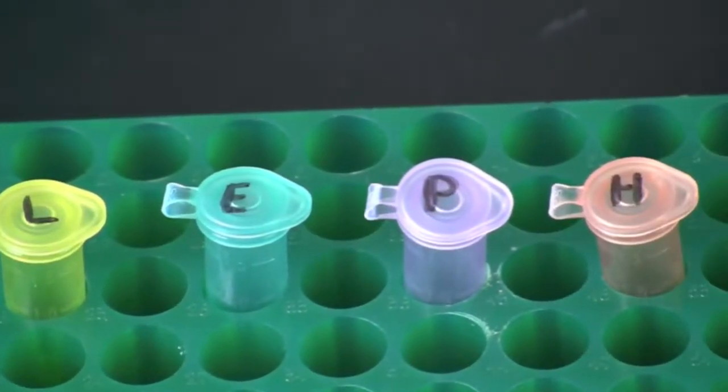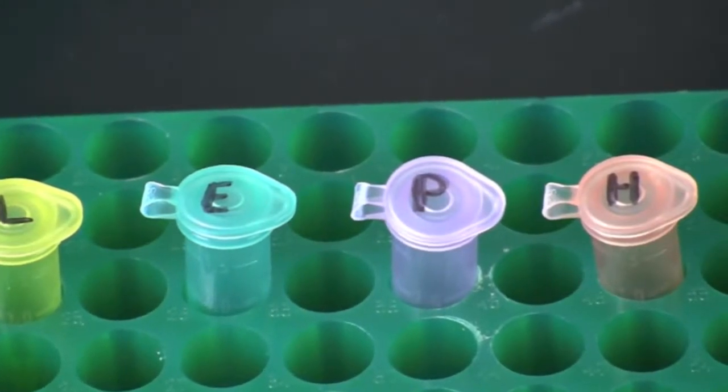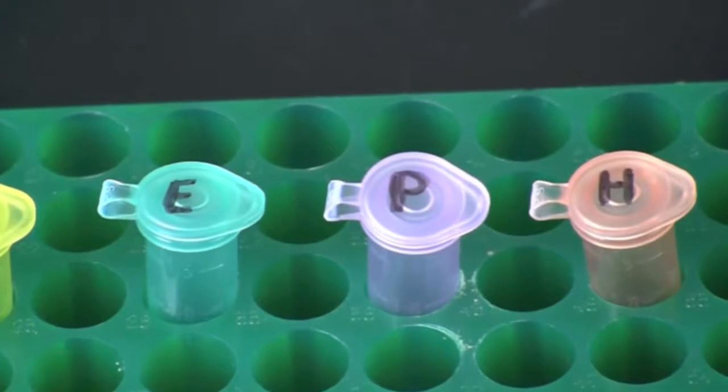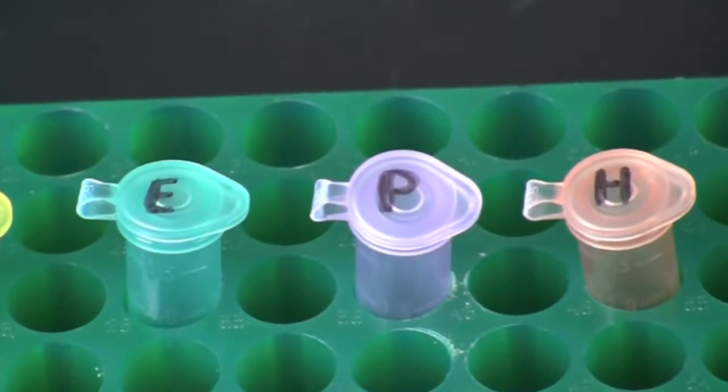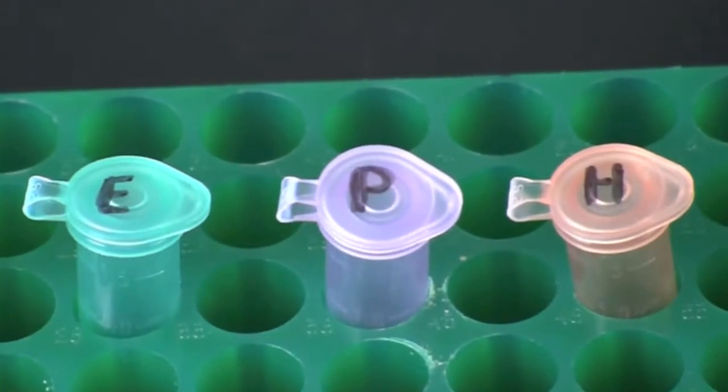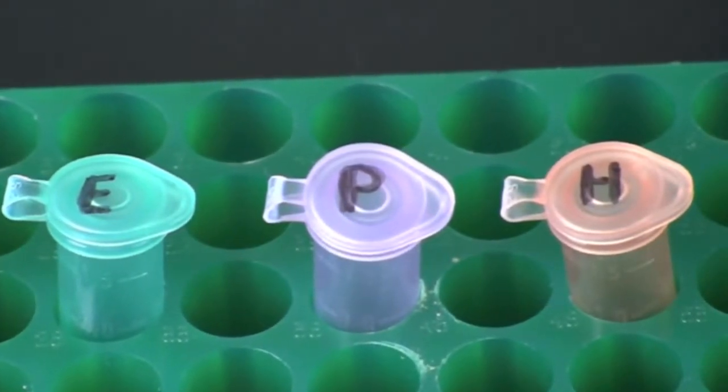Label four color-coded microcentrifuge tubes with L for lambda DNA, E for ECO-R1, P for PST1, and H for HINDI-3. Label all of the tubes with your initials and date, and place them in a microcentrifuge tube rack.